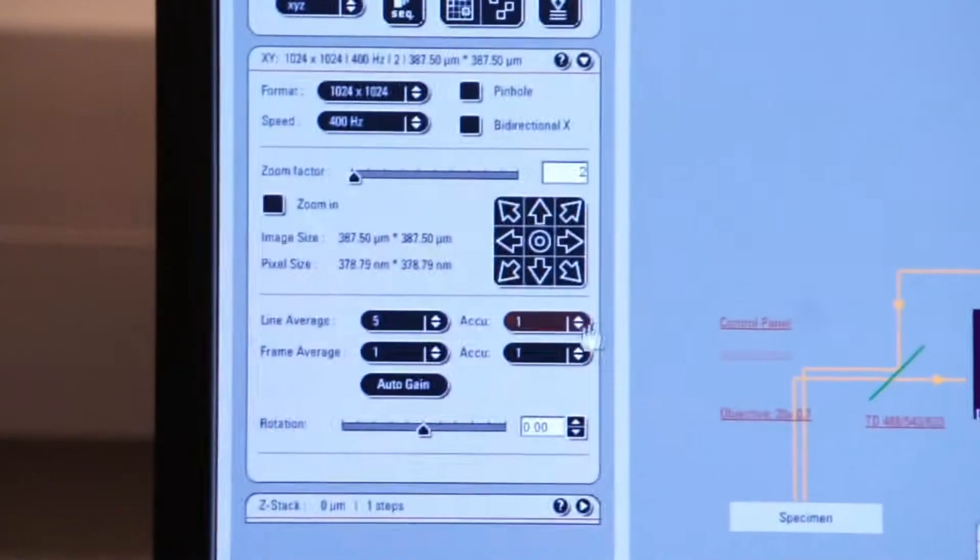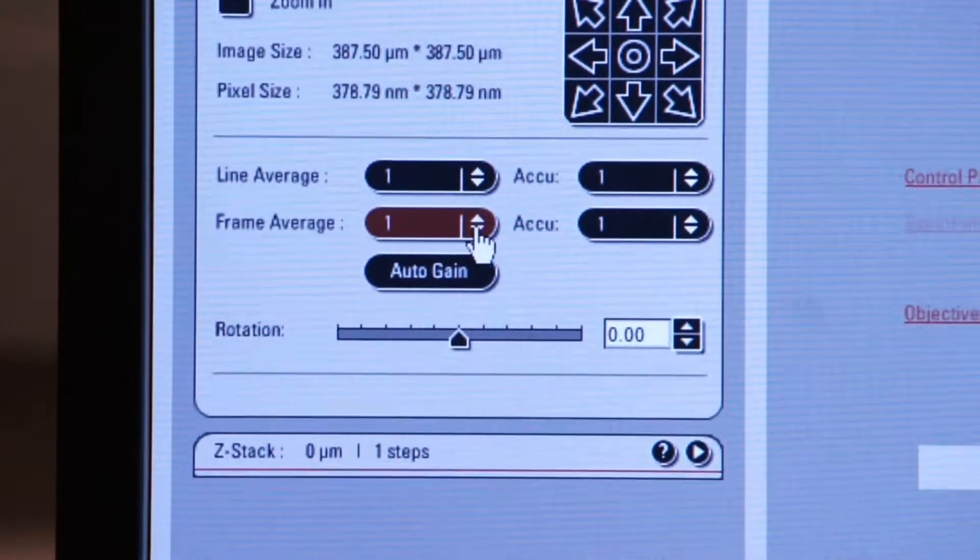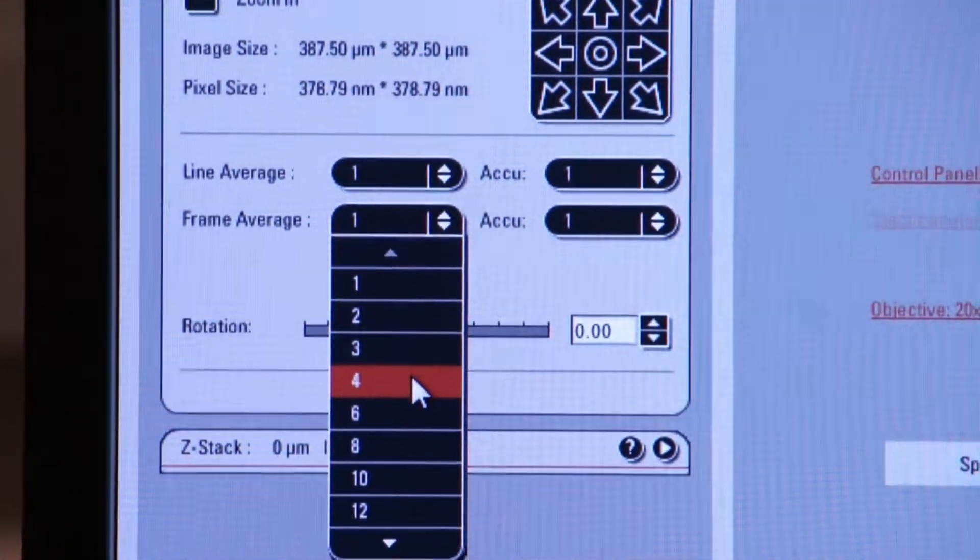Let's try that with frame averaging. So we'll go back over here. We'll turn line averaging back to one and we'll take frame averaging. Let's make it four frames.